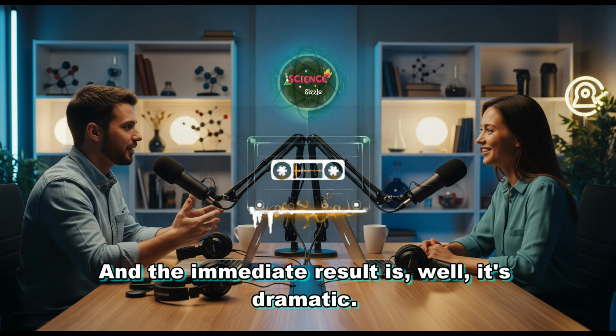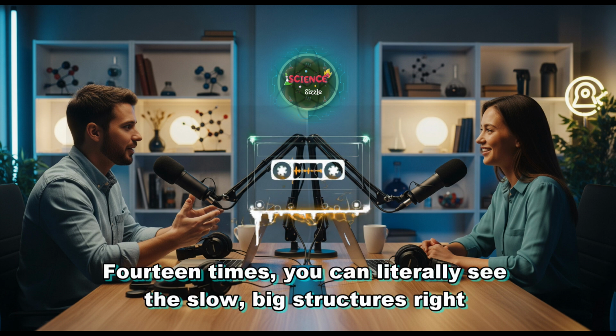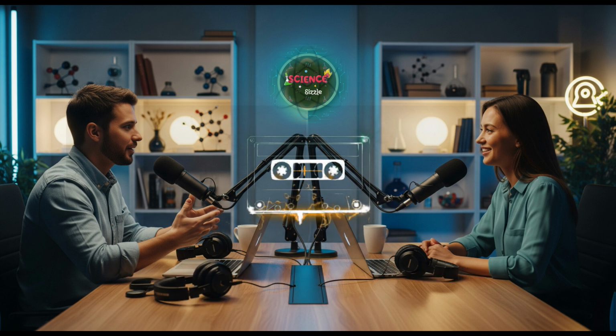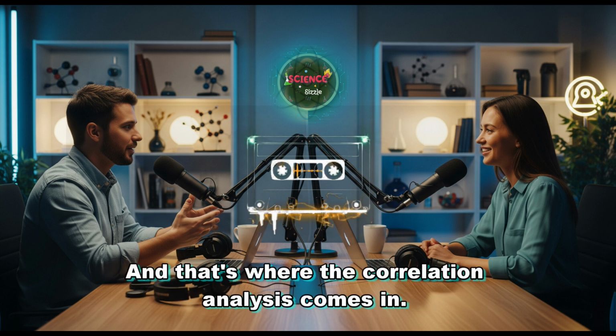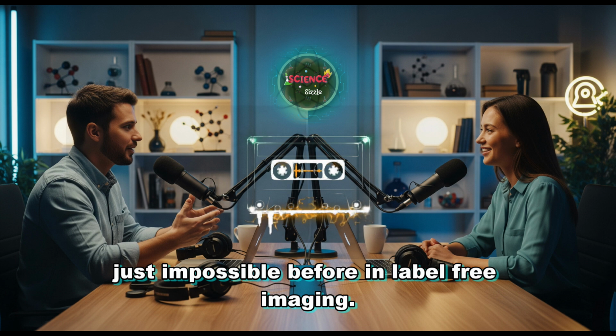Precisely. And the immediate result is dramatic. You get a dynamic range that's 14 times wider than QPM could ever achieve on its own. So you can literally see the slow, big structures right alongside the hyper-fast nanoscale particles, in the same frame. Achieving that range is one thing, but interpreting that flood of new data is the real challenge. That's where the correlation analysis comes in. That's the real breakthrough. It allows for an enhanced particle characterization that was impossible before in label-free imaging.